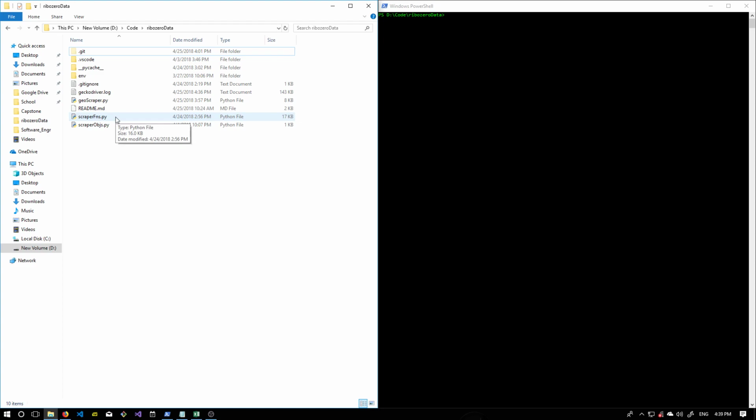Scraperfunctions.py contains all of the heavy logic code that was used in our scraping, just to clean up GEO Scraper. And then scraperobjects.py was used to store all of the objects that we used to help make the program a little bit simpler to read regarding what was being returned, because having a 2D array for everything can get kind of complicated after a while.